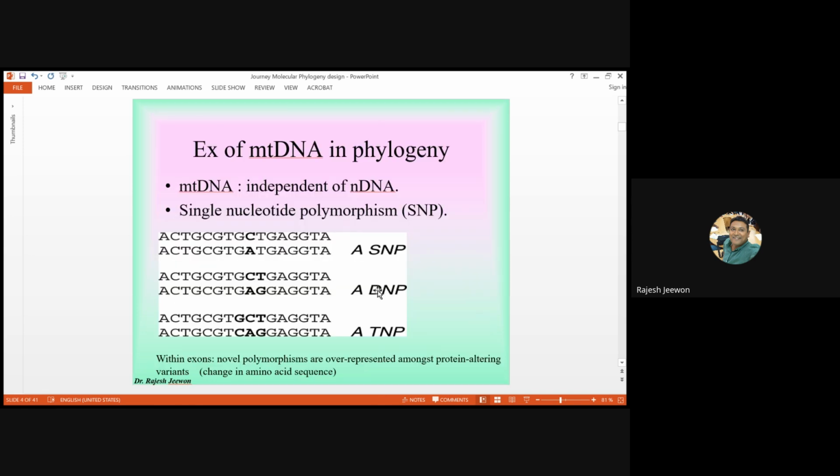When we look into our alignment, there are things we need to look into. For instance, when we check our nucleotides, we've got to see where the changes are, where the substitutions are occurring, and what types of mutations there are. Sometimes we have single nucleotide polymorphisms, and that is very important whenever we talk about alignment.